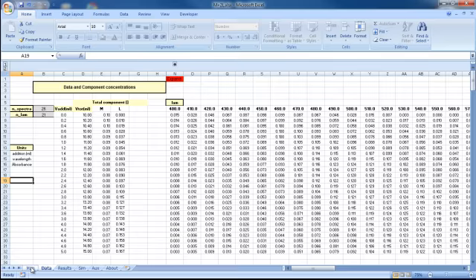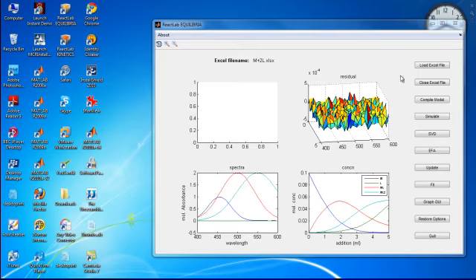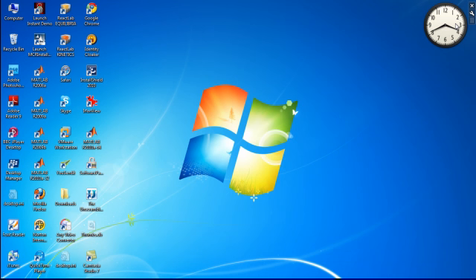That concludes this demonstration. I can now save the workbook, which provides a complete snapshot of the analysis session. This can be reloaded into ReactLab later on to continue or revise the analysis, or can be reviewed and processed by Excel independently. Thank you very much for your attention.